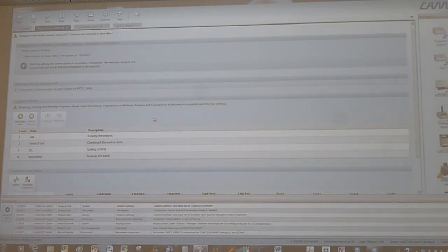You could have different reasons, even 20 reasons for signing, but just one level. One reason was I made the analysis, the second was maybe I checked the analysis, the third was yes, the analysis is okay, the fourth was I had to redo the analysis, and maybe one, yes, QC is okay with it, batch released.